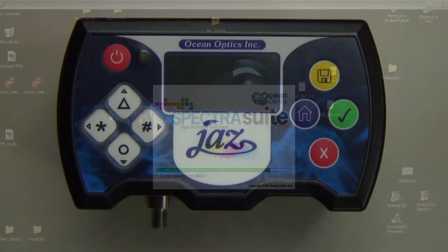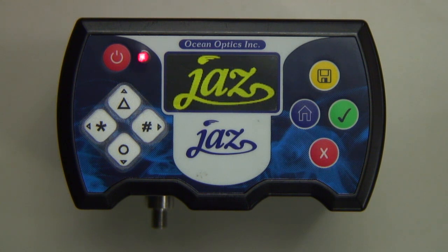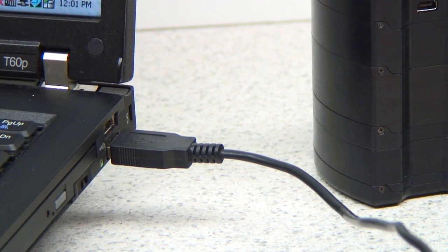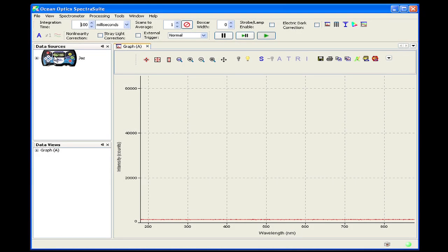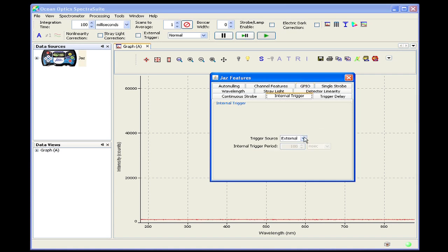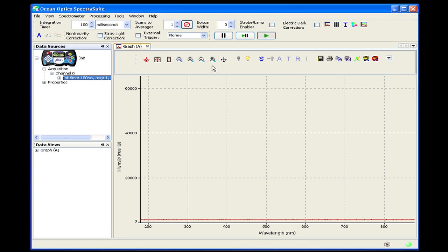Finally, let's take a look at Jazz PX function in Spectra Suite software from Ocean Optics. We've turned off the Jazz to reset our current parameters. Now we'll connect the Jazz to our computer with the mini-USB cable. Turn your Jazz on and open Spectra Suite. We'll now walk you through the process of setting up the Jazz PX in free-running mode. Right-click on the Jazz image and access the Spectrometer features. Select the Internal Trigger tab. We'll set the trigger source to Internal and the trigger period to 10 milliseconds. Back in the main Spectra Suite window, click Strobe Lamp Enable — and we're off and running.